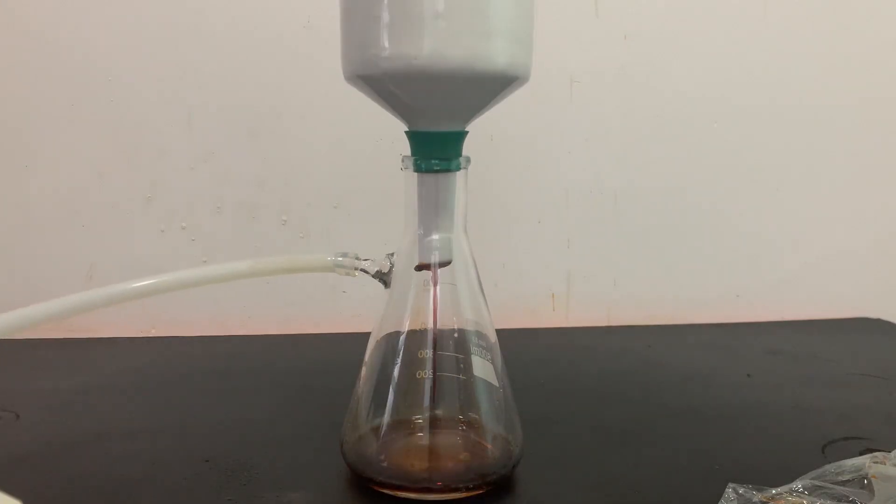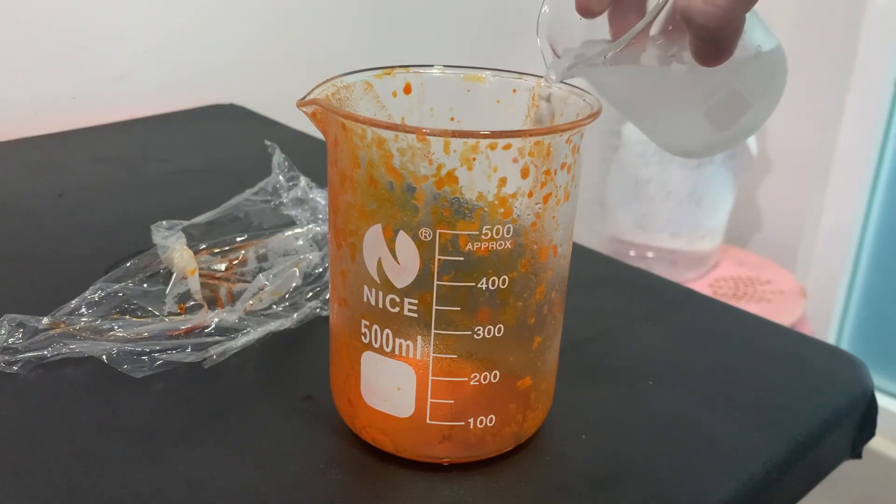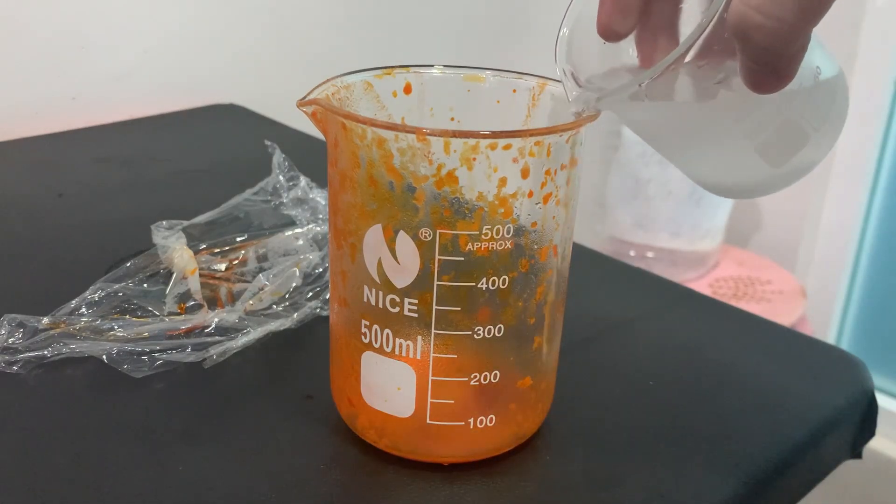After cooling, a vacuum filtration is done to separate the methyl orange. I washed the beaker with cold brine to get out as much of the methyl orange.